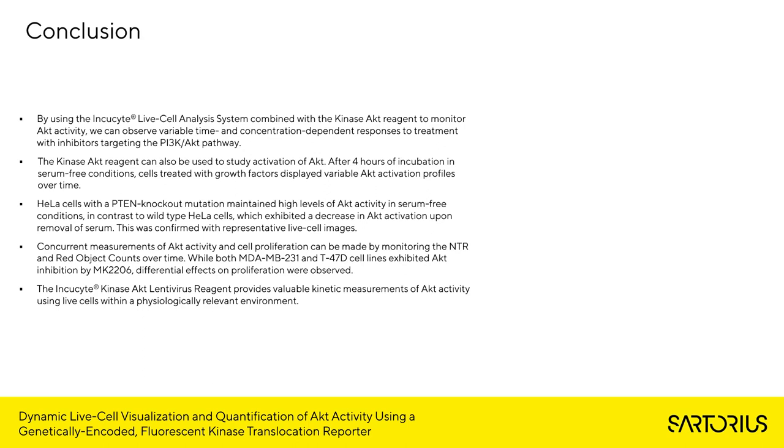After 4 hours of incubation in serum-free conditions, cells treated with growth factors displayed variable AKT activity profiles over time. HeLa cells with the PTEN knockout mutation maintained high levels of AKT activity in serum-free conditions, in contrast to wild-type HeLa cells which exhibit a decrease in AKT activation upon removal of serum. This was confirmed with representative live cell images.